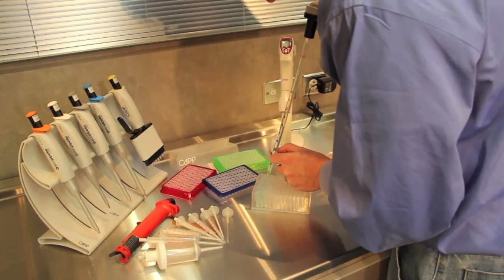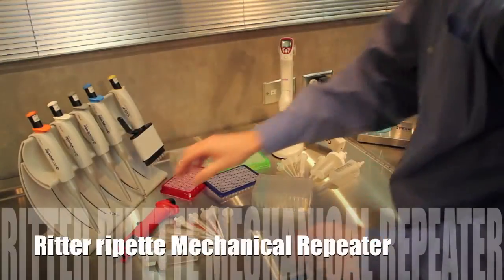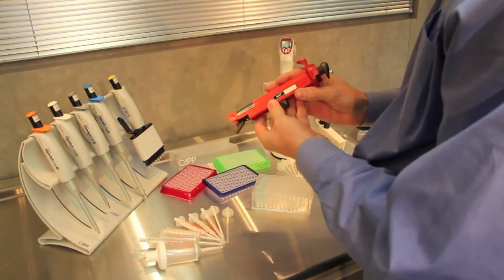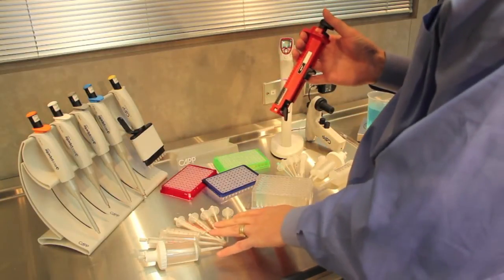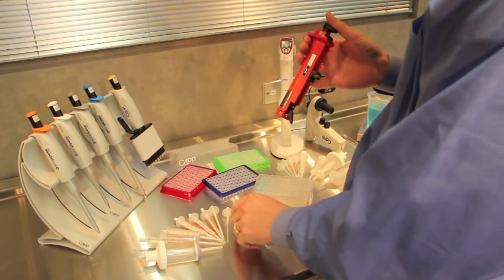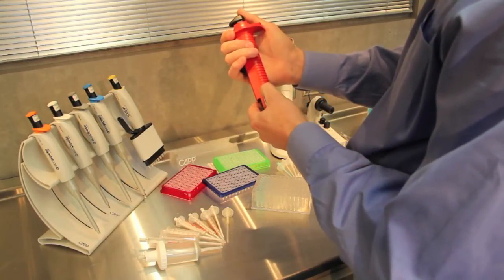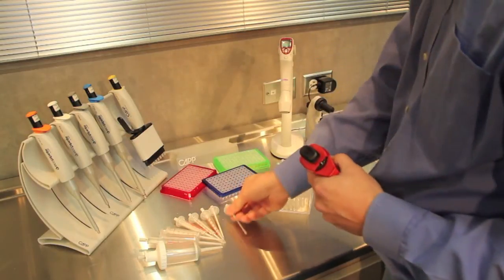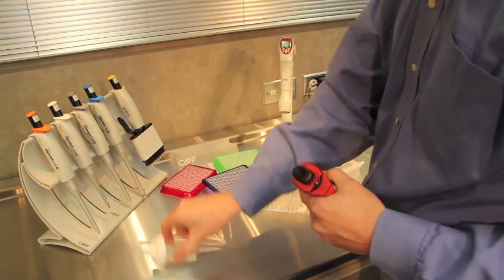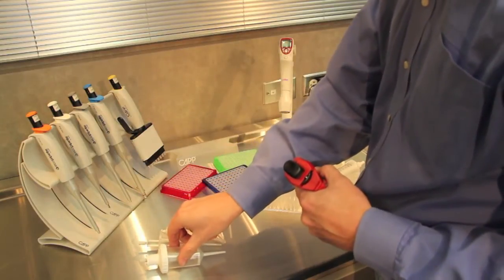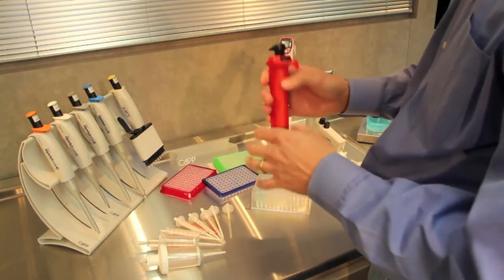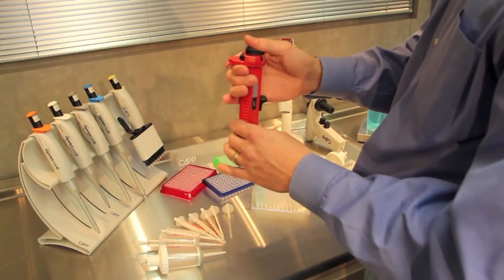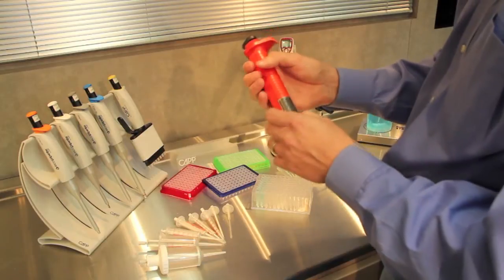The next option is going to be the Ritter Repette mechanical repeater. These work by selecting a syringe size - they go from a 0.05ml syringe, which is this little guy, up to a 50ml syringe. By selecting the syringe size and by selecting how far the plunger moves when you press this button, you can get a variety of volumes dispensed.